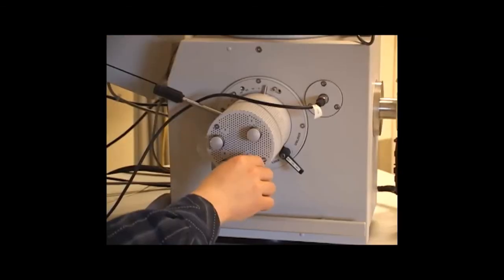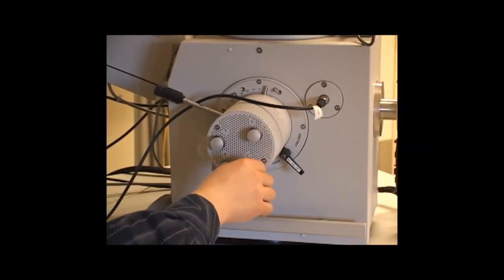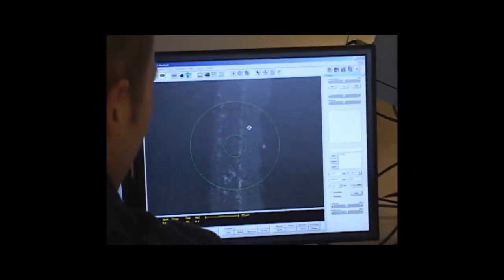This is corner number 1. You can see I've scribed the number 1 through the resist layer here. I zoom in on it, you see that it's out of focus. I don't actually want to focus this in the normal way. What I want to do instead is raise the stage up until this comes into focus. So I'm going to need to turn the stage height on the chamber door over here on my right. And as I raise the stage up, the image on the screen comes into focus.